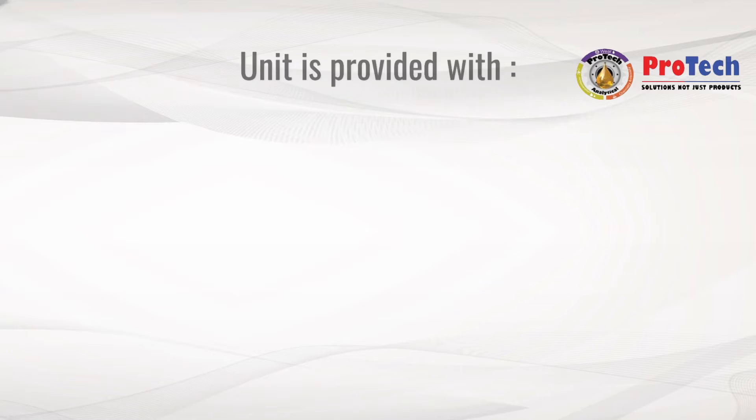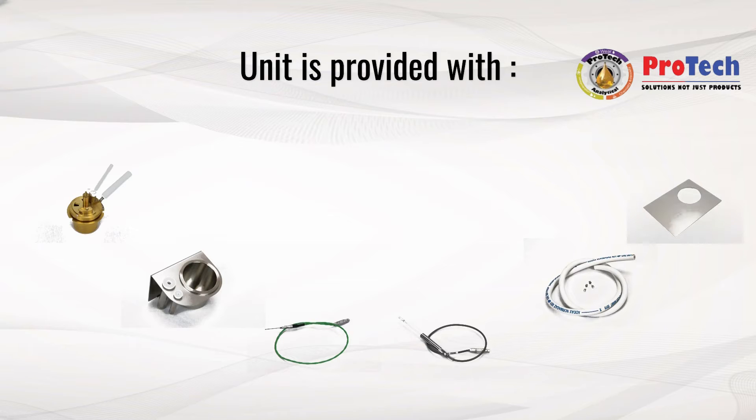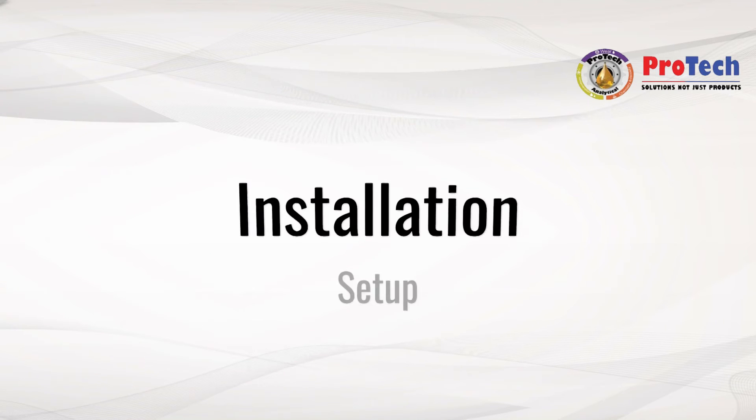The NPM 450 is provided with a sample cup and lid, an accessories holder, a detection thermocouple, a sample probe, gas tubing, spare fuses, a protective panel, and a power cable.